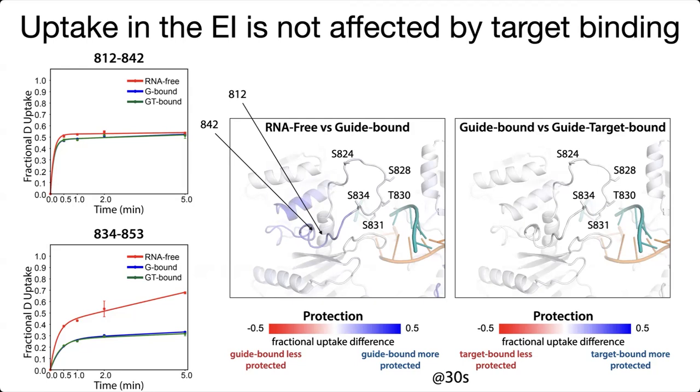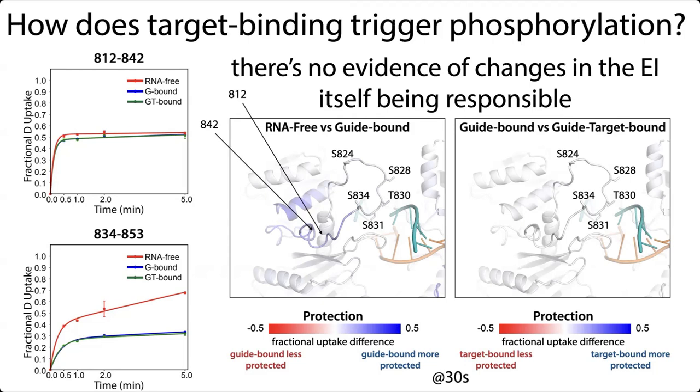There could be changes in the conformation that are happening in these different forms. However, because it's already at such a high exchange, we might not be able to really tell. Nothing too dramatic that we can detect with this technique. It doesn't mean that there aren't changes occurring. There just aren't changes that we can detect with this technique.